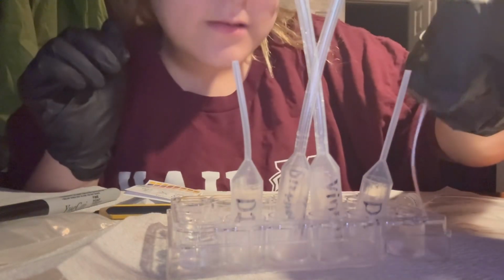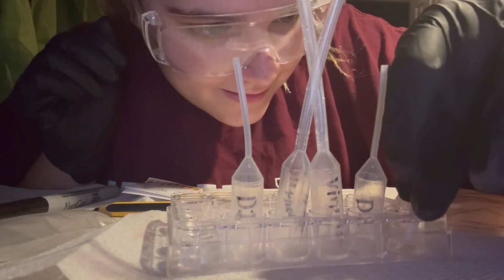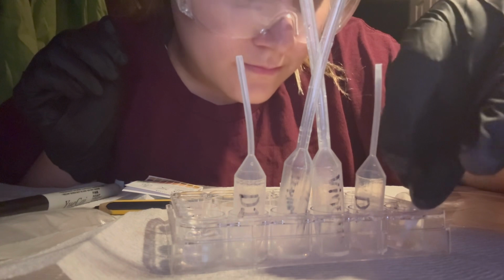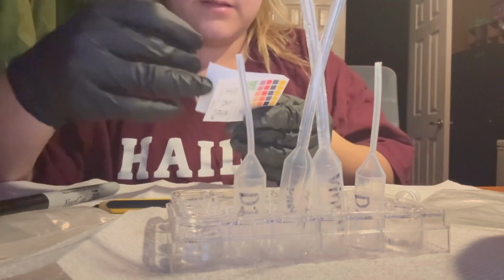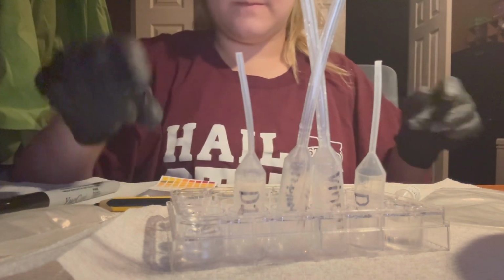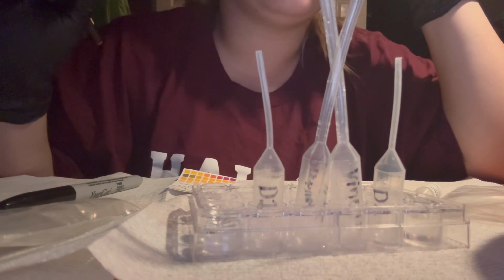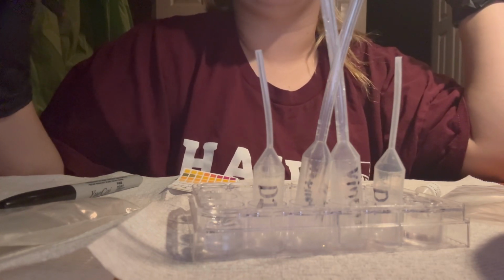So here we go. Make sure the entire thing goes in there like that. And the pH level of this is, let's turn this, is 4. It has a pH of 4 right now. So we'll put it into the data table. We'll use a short stem pipette labeled well D1 to add 2 drops of the 0.1 molar HCl from well D1 into the buffer in well A1.